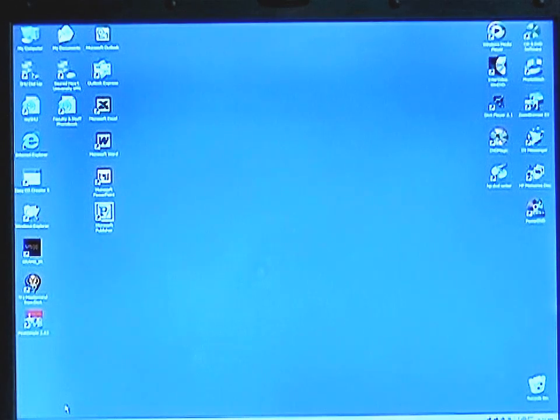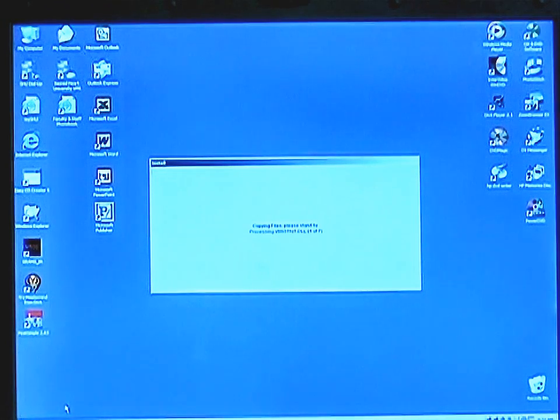And run the setup program from the A drive. The software will load several Windows-based files and prompt you for disk 2 after the initial files have been loaded. Depending upon the operating system and the BIOS for your computer, you may be required to copy an INI file to the Windows and Easy Scan folder directories. Disk 1 contains a rather large file and it may take a minute or so to properly load it into the system.